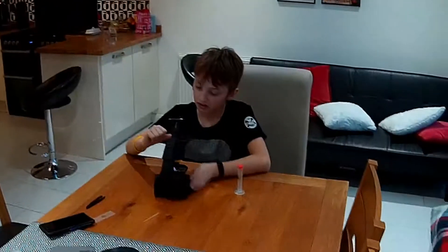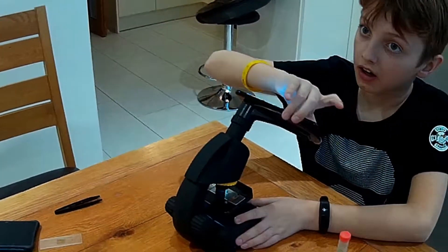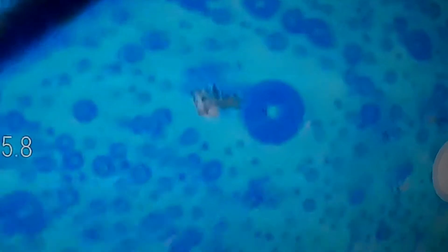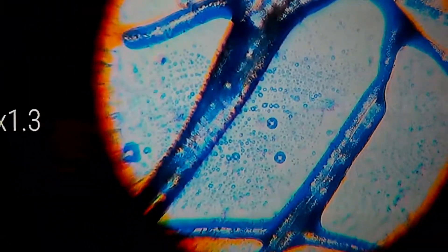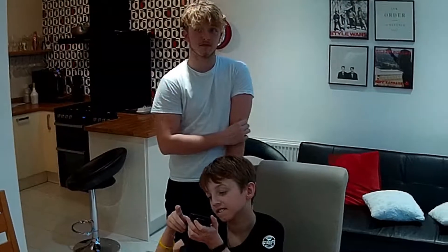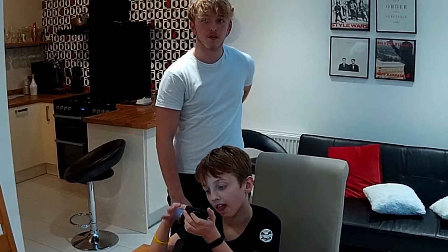I can show everyone now what we can see down the microscope — whoa! Will, orient the phone sideways to get a bigger view. If you zoom the picture on the phone screen, you get even better magnification. You can see these two little blobs — we don't know what they are. What do you think they are, Big Brother Luke? They're called artefacts — if there's something on the microscope lens, that can happen.